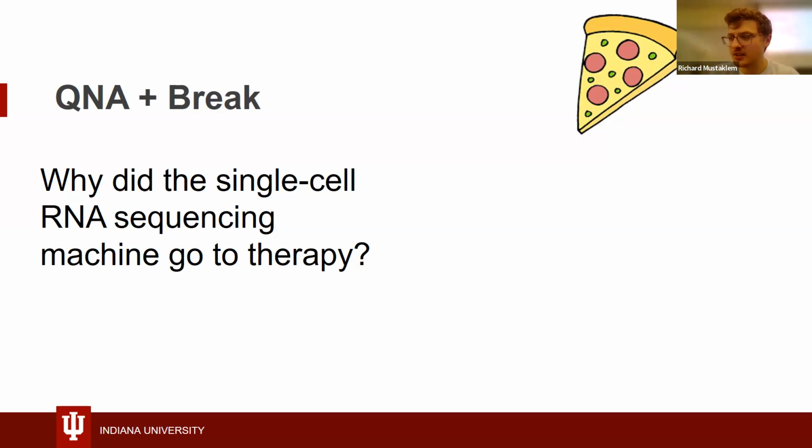For me, the reason I do that is I think it's just easier. But there have been studies that show that integrating before can lead to extra dirty data. Personally, I don't have an answer to that, but that's just what I do right now. I know there are some people working on that specifically, and you can even make that your project. If you want to put together a project showing the differences of integration, that's a perfect example. Everything in this pipeline is so brand new that you can make that a project. Hopefully that helps answer your question, but there's no real way for integration right now. There are two sides to the coin.